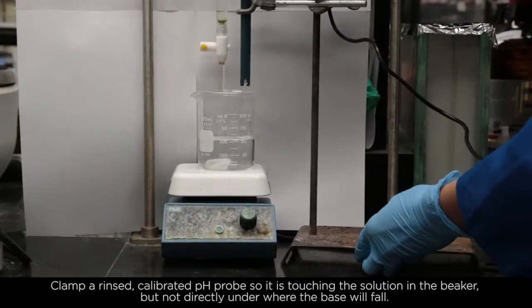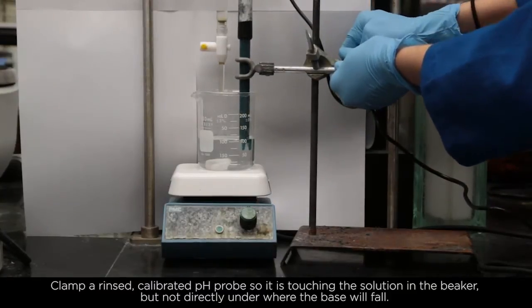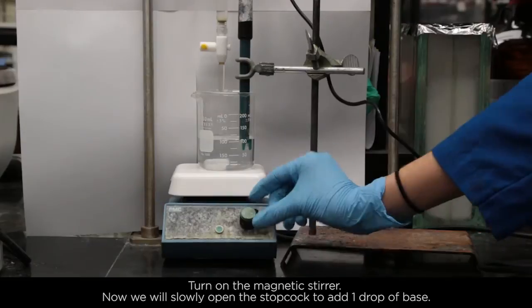Clamp a rinsed calibrated pH probe so it is touching the solution in the beaker, but not directly under where the base will fall. Turn on the magnetic stirrer.